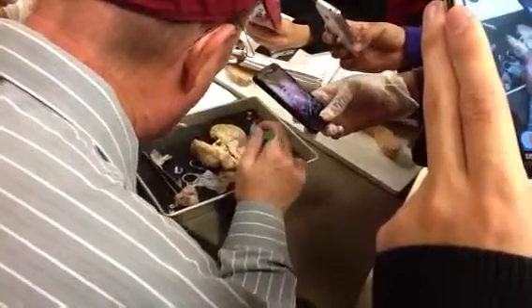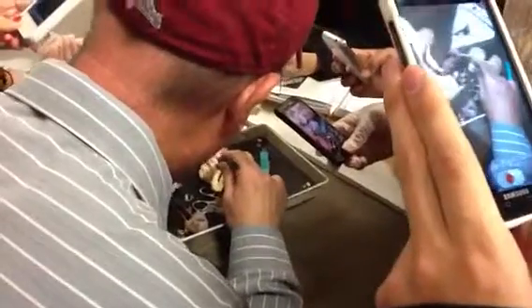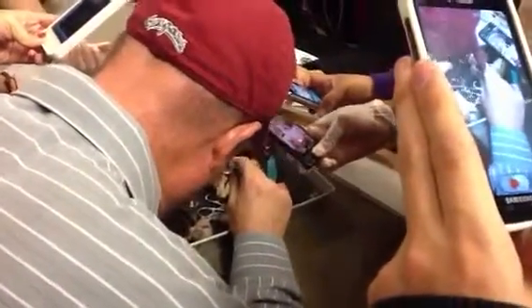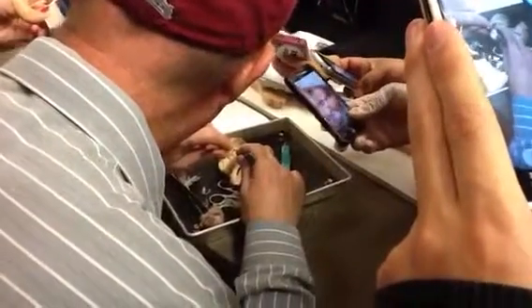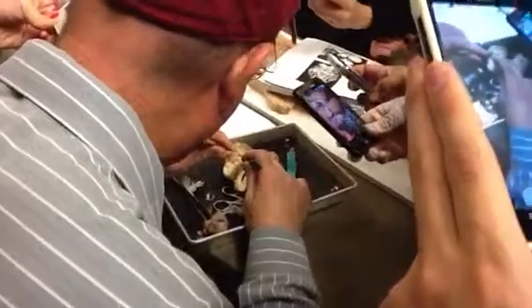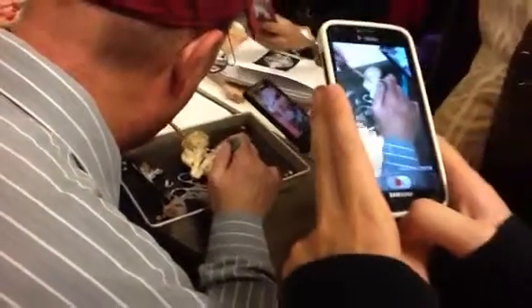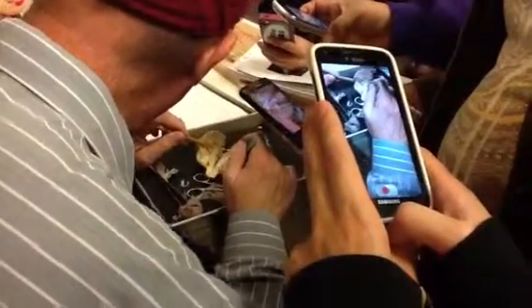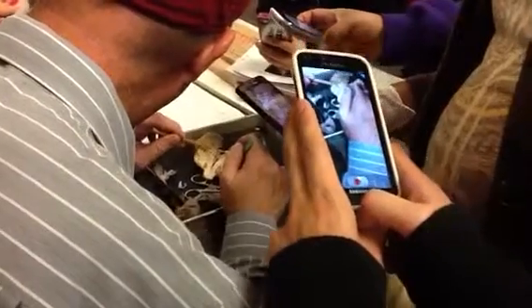Okay. The choroid plexus is right in here. It's this darker tissue right here, and it's in the third ventricle, which is right there. So it's deep as well. There's also a fourth ventricle. The fourth ventricle is near the transverse fissure. It's down here. That's the fourth ventricle. Did I have those on there? Yes, you do.